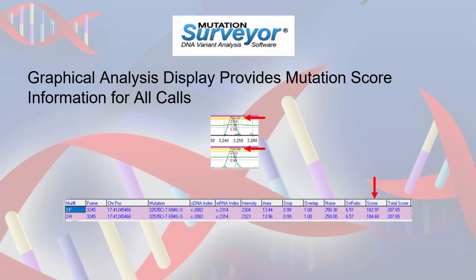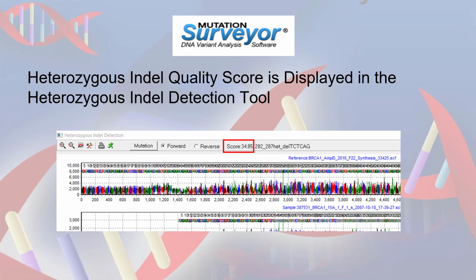Mutation scores and their associated values are displayed in the graphical analysis display. For two-directional data, the mutation score of the forward directional trace and the mutation score of the reverse directional trace are summed, and the sum score is used to determine if the mutation call is rejected, passed, or put into check. For substitution calls, the mutation score is also displayed in the mutation electropherogram at the location of the mutation peak. In addition to the graphical analysis display, indel quality scores for heterozygous indels can be found displayed at the top of the heterozygous indel detection tool.